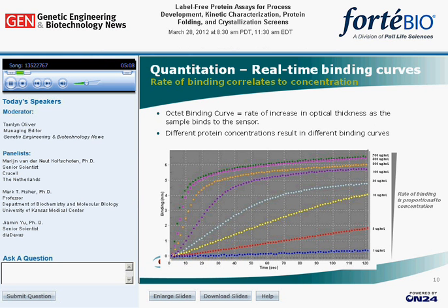In this slide, binding curves are depicted, obtained from dilutions of standard IgG samples. The Octet protein A assay makes use of the fact that binding rates are proportional to the concentration of IgG. From the measured binding curves, the quantitation software of the Octet calculates the binding rates for each IgG concentration, which are subsequently plotted against the IgG concentration to obtain a calibration curve. Next slide.